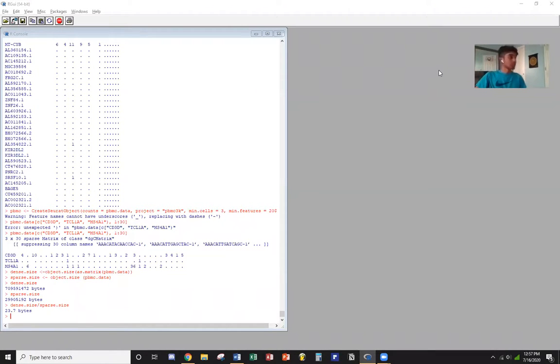All right. So actually last time, my Zoom had crashed, so that was why there was an abrupt stop. But I think it's better if we just do a part one, two, three series. So this will be part two in the series where I'll be doing guided clustering with Seurat. We left off with telling the various different sizes of the data.